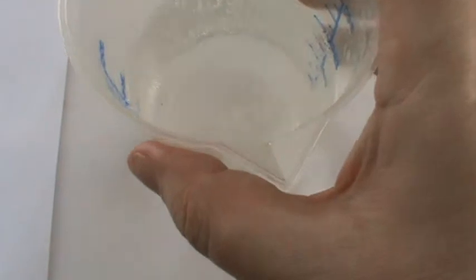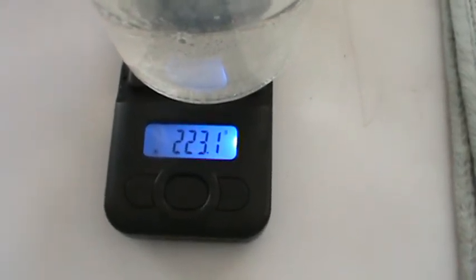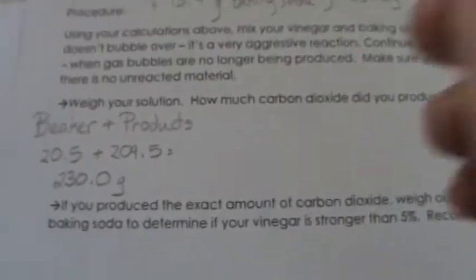Okay, so I'm going to go ahead and turn on my scale. Give kind of final taps. And now I'm going to set my beaker with my reactants on my scale. And I get 223.1 grams. Let's come over here.